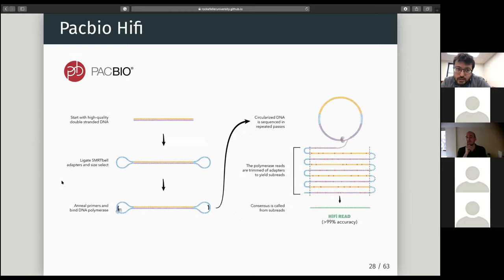Right. So the winner of all these competitions is PacBio again. As I said earlier, PacBio came up with a big improvement that changed the game. I think someone said they used PacBio HiFi for bacteria. So how it works: you have this double strand DNA, large fragments, around 15 to 20 KB. Each color is a different strand, yeah?